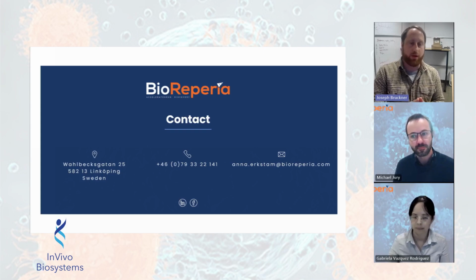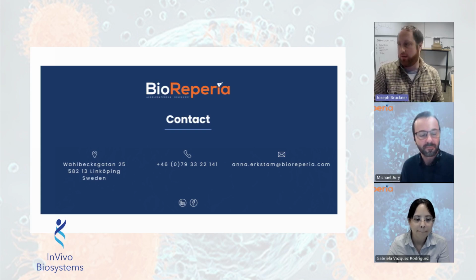One example of what we've done in that regard, and that's commonly done in zebrafish, is a tail wounding assay. We can wound the zebrafish on their tails and then live image the response of immune cells to that injury. That's a simple, easy paradigm. But because they're transparent, not just in the tail but in a lot of tissues at these early stages, we also have access to immune cells in more complex tissues like the brain, where, because of the ease of transgenic manipulation, we can also label immune subtypes. So we can label microglia, for example, and look at microglial responses to different insults.